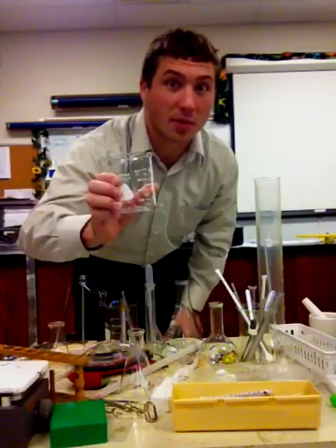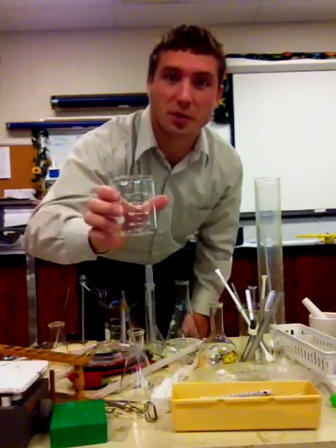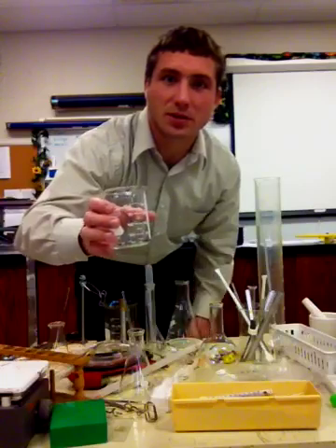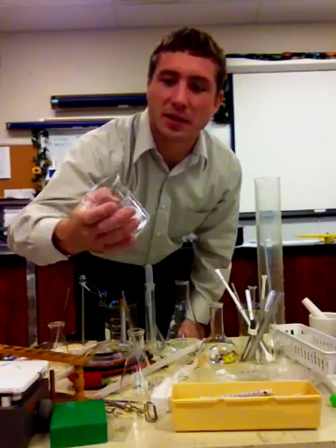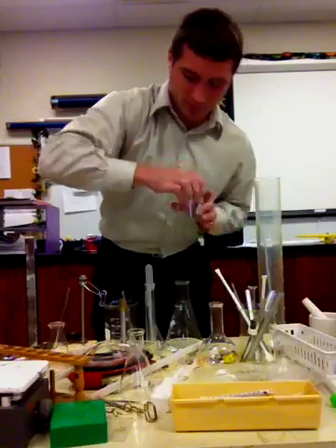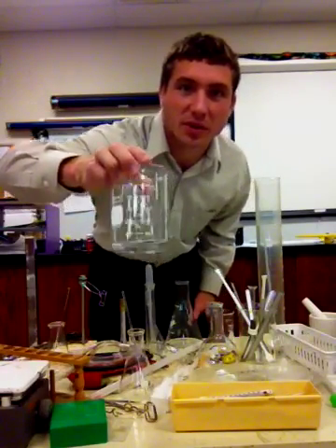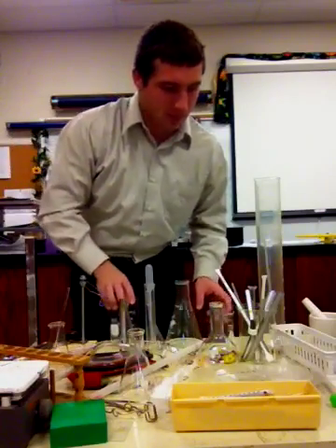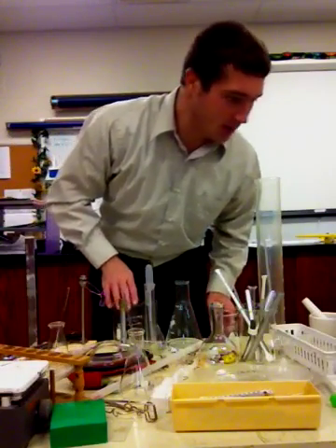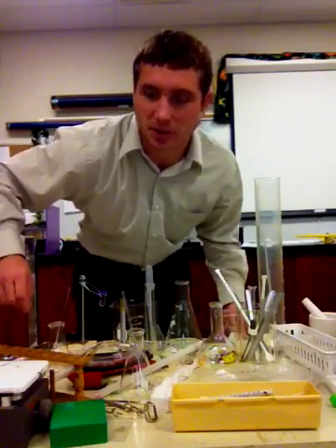Which leads us to our next one: the beaker. We have several different sizes of beaker. This is actually a 200 milliliter. There's one larger and one smaller — here's the larger one at 500 milliliters. And there is also a 50 milliliter beaker.